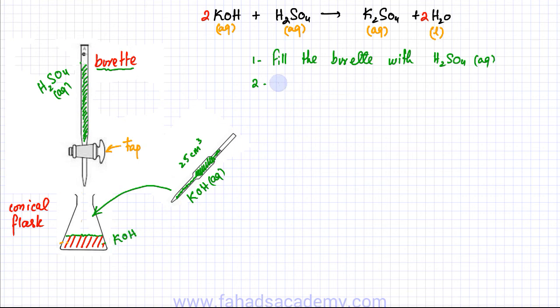So I'm going to pipette 25 cm cube of KOH aqueous into a conical flask.